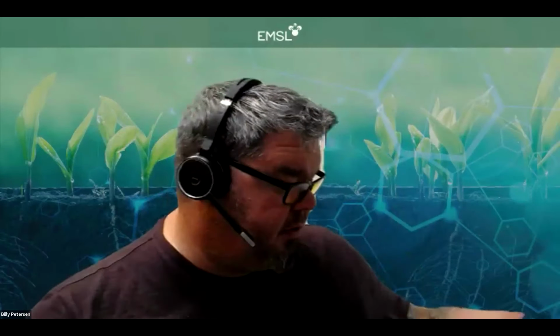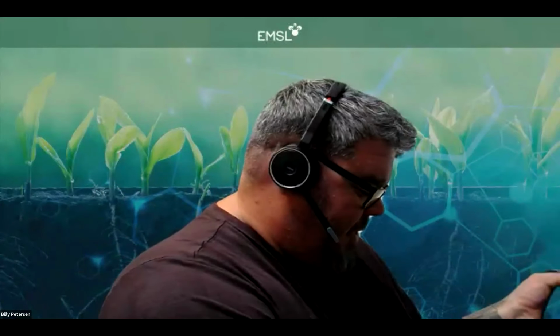One of the things they were so nice to provide me with for doing roots is a really cool drawing tablet, which you obviously can't see, and a lot of it involves a lot of writing and a lot of coloring. So there is something valuable I got from kindergarten. Let's put it that way. Lots of coloring. You have to go through each individual slice and basically follow a root down, and you can tell when it's a root. You've got an actual thing going down and then branching off. You just have to follow it down and mark it in there individually.